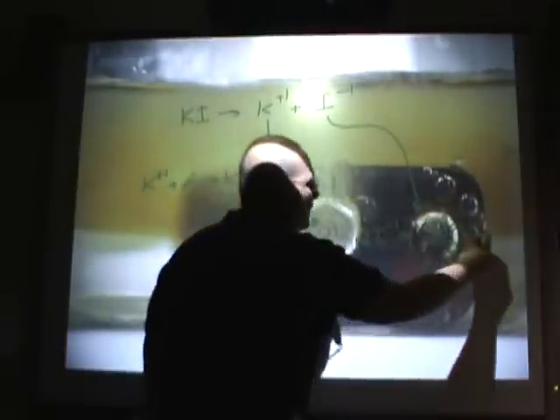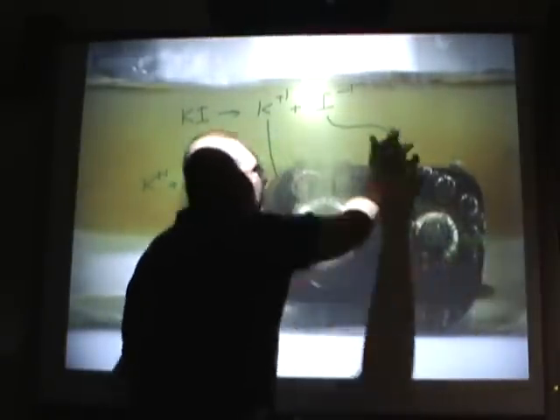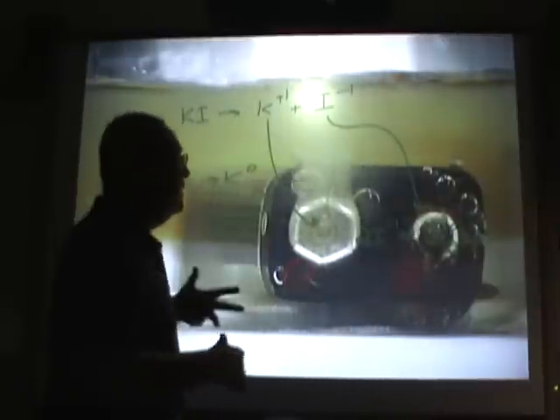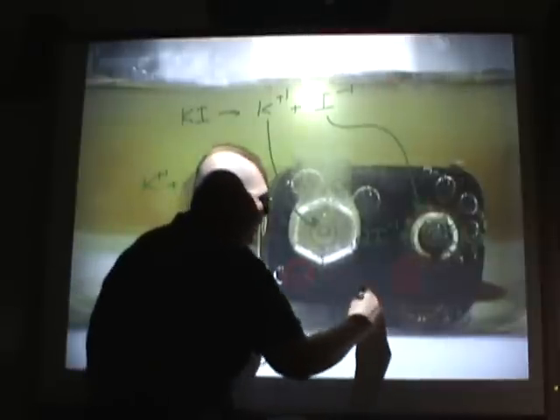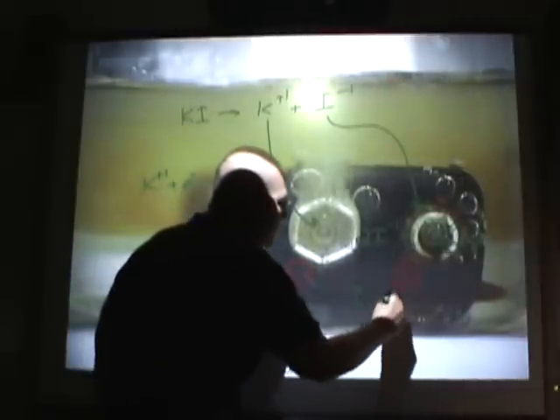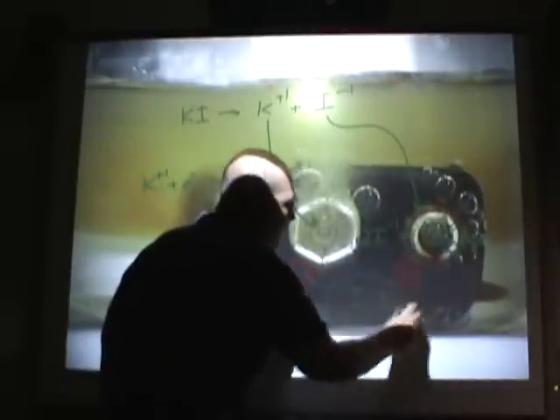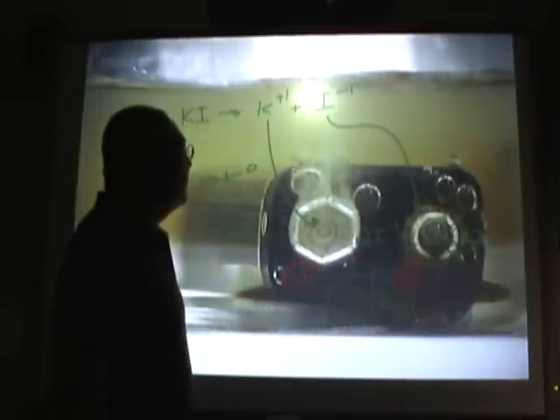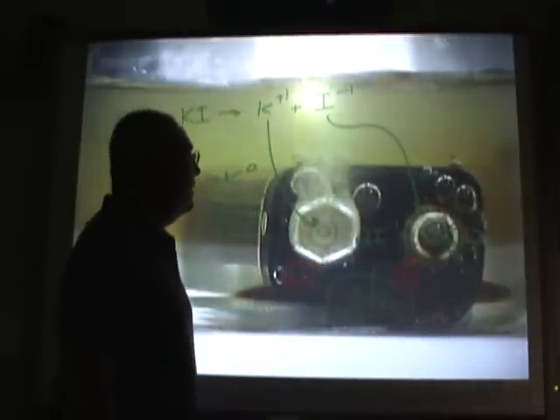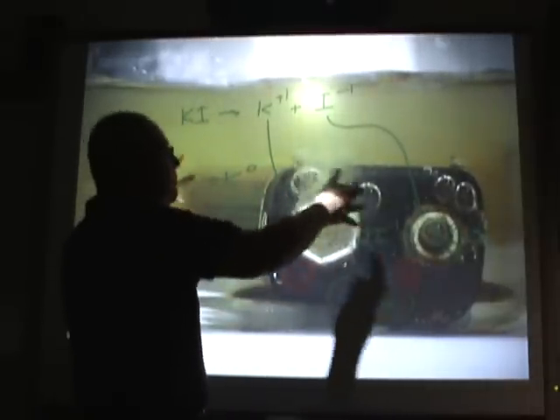So this brown, this reddish brown stuff, whatever this is, that's iodine. Now, iodine is not water soluble. You might remember that the iodine molecule is nonpolar. So it's not going to dissolve in the water. So we're actually getting microscopic precipitate here.